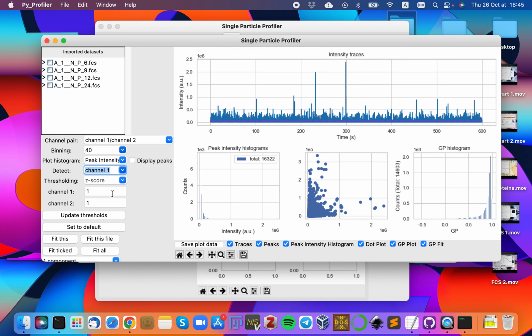You can also calculate this, but for that you need to do proper studies of the molecular brightness of RNA molecules. In this case, for every RNA we had one Alexa 647, and you need to calculate the molecular brightness, but it wasn't that easy in this particular case because RNA aggregated in solution, and we couldn't actually know the brightness of one RNA molecule.